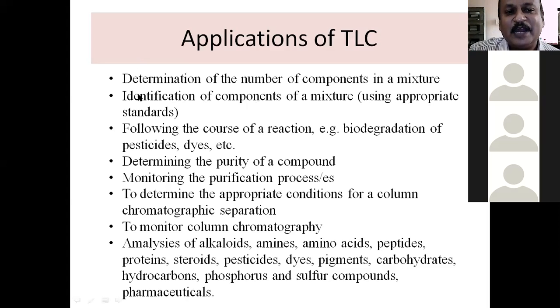TLC can be used to find out how many different components are present in a given mixture. It will also help you find out the identity of the sample components. Of course, for this you need to run standards also. You can compare your sample mixture with the standards and then identify your sample components. You can also follow the course of a chemical or a biochemical reaction.